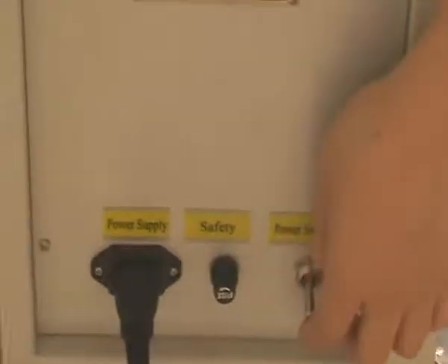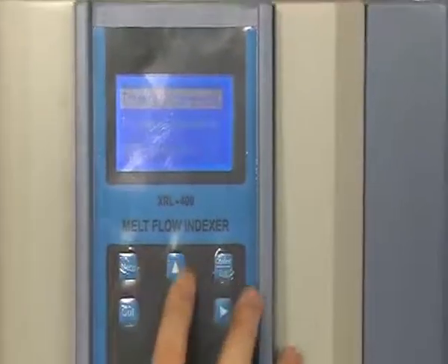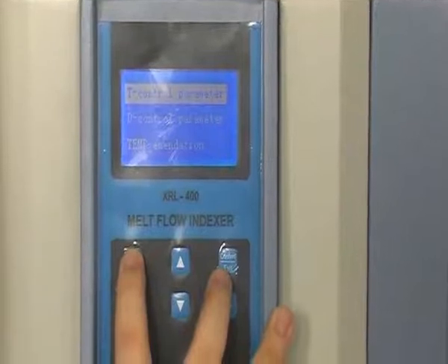Turn on the power, then go to the welcome interface. Press menu to enter the text type interface. Press up and down to select the text type. Now we select temperature control, then press menu to confirm it.